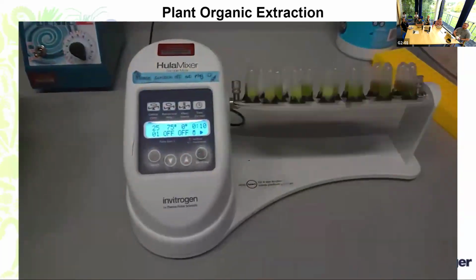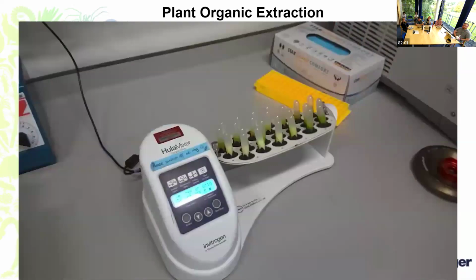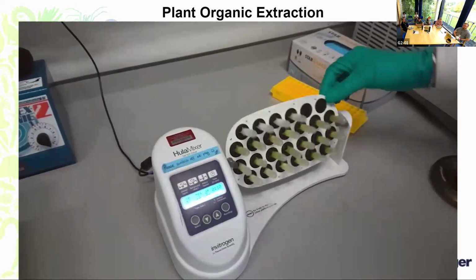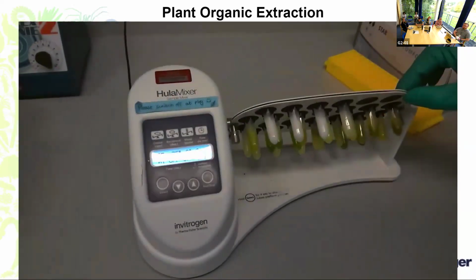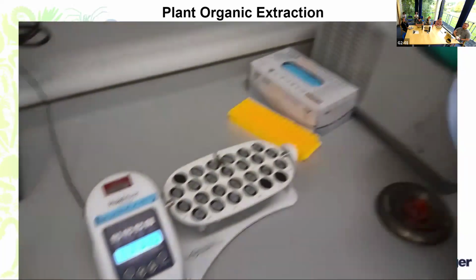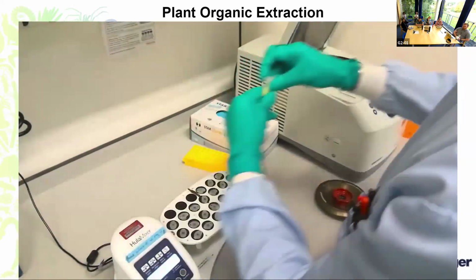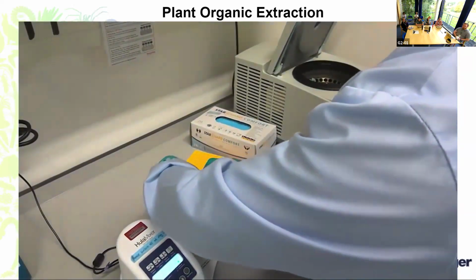As we've seen there, there's a range of different sample types. I believe this particular batch had a couple of orchids in, and a number of algae that are seen at the front. So this protocol is used for a very diverse range of taxa and plant samples, for similar phenotypes you see in plants.